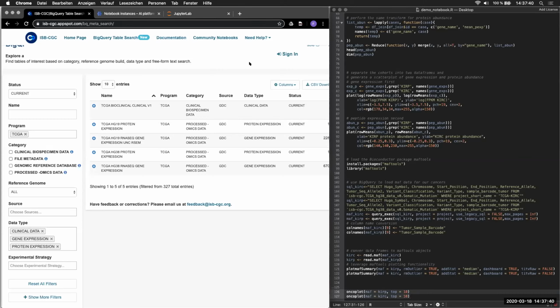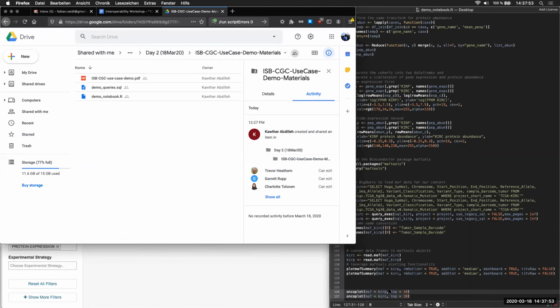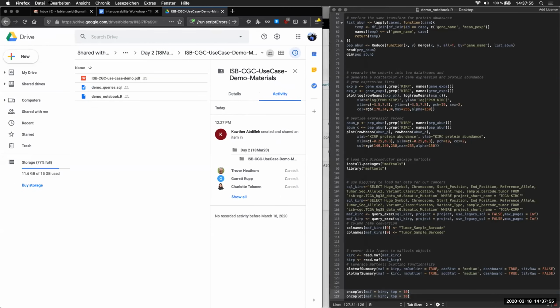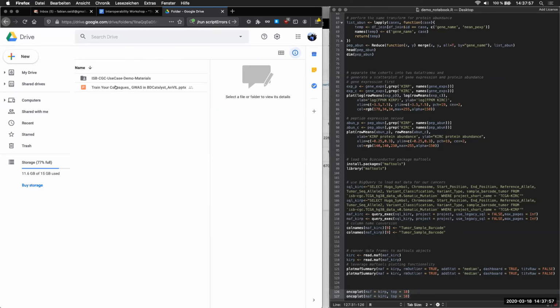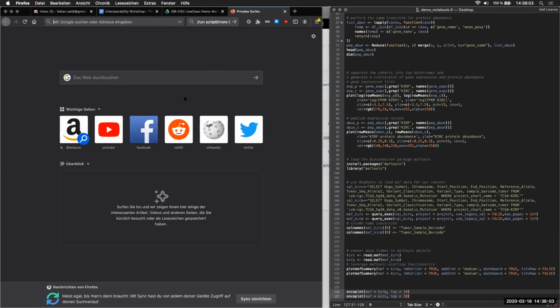Are you planning on making the analysis scripts that you're showing on the right side of your screen available in general? Yes. So I have those, we have those in the ISB. I guess I'm asking as a resource to users. Yeah, I mean, we have a lot of those types of things in our community notebooks, actually.